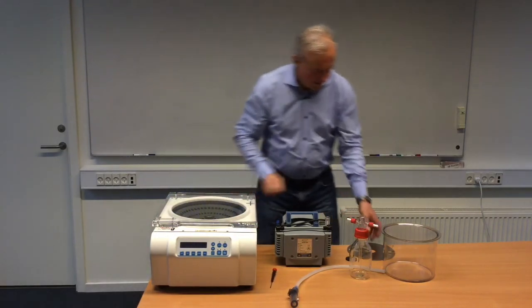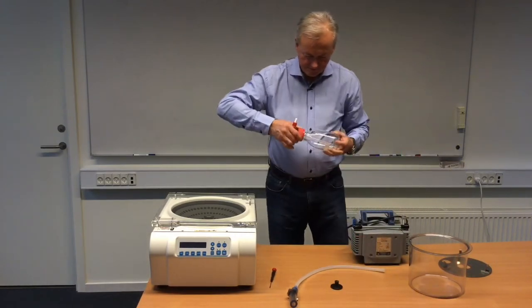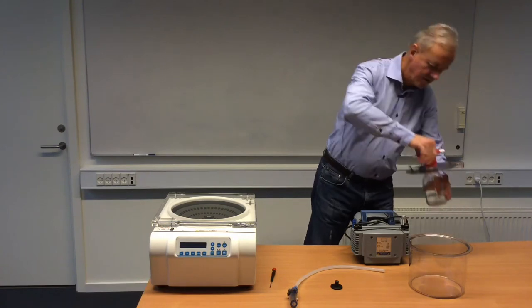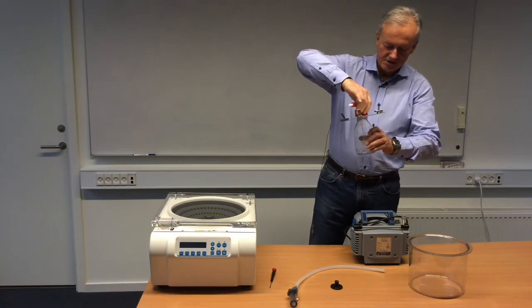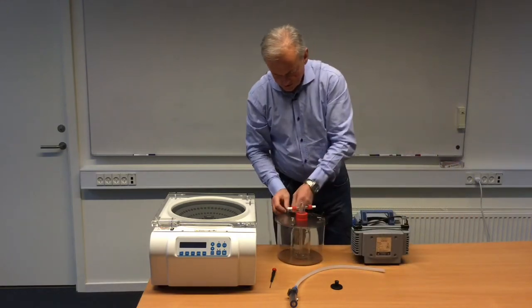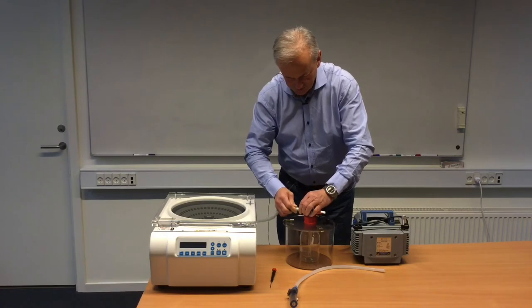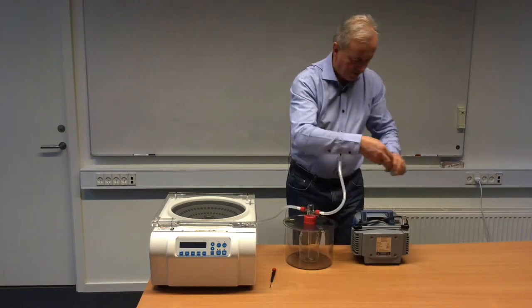Then we have the drip catcher system. Place the lid — be careful, because this glass pipe is quite sensitive to physical damage. There are three locks so we can make sure that we actually catch the vapor inside. Then put on the hoses, with the other one connecting to the vacuum pump.